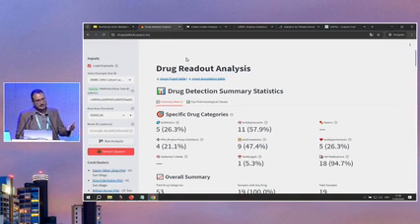And then you can basically add that information to the GNPS job, and then add the libraries. The drug readouts is just part of one of those libraries that we've curated for drugs, but you're going to have a lot of them, and one of the newest ones is the conjugated library. As I said, it's still under development.